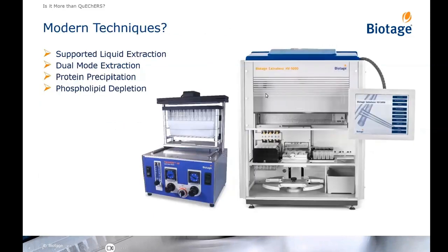And then, is it open to modern techniques? One of the things about QueChERS is it's there. It's QueChERS, it's great, it works, but what else can you do with it? Most sample prep for solid phase extraction is developed on cartridges or plates, and there are new techniques that go beyond, and some are even simpler than the solid phase extraction techniques. One being supported liquid extraction, a very, very simple technique, but used by several labs for quick and effective cleanups. Dual mode extraction is another technique that can be used. Protein precipitation is a unique technique, and phospholipid depletion is also another technique. And these all are applicable on the same systems that process the QueChERS columns.